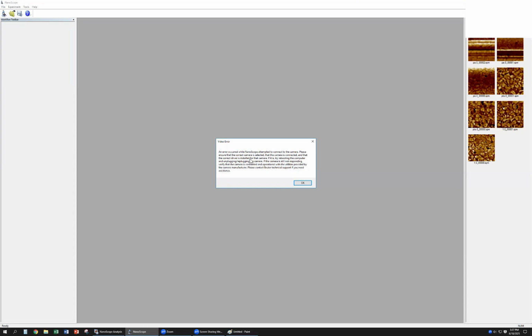So we don't have kilopascal samples. He said I can buy another cantilever. They already give you the K and the R. So if you buy that kind of probe, you may get very accurate data.